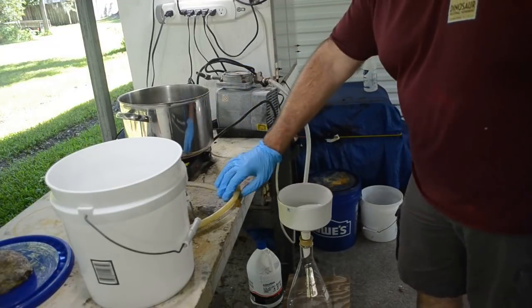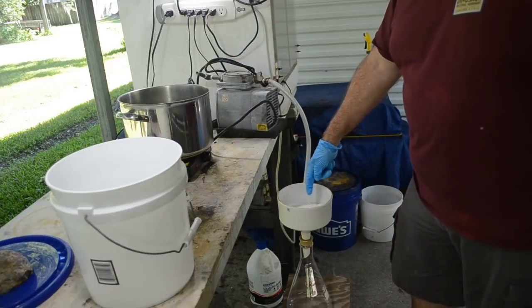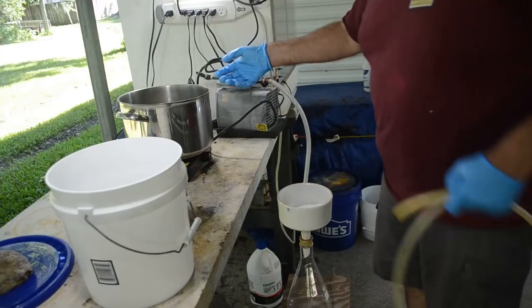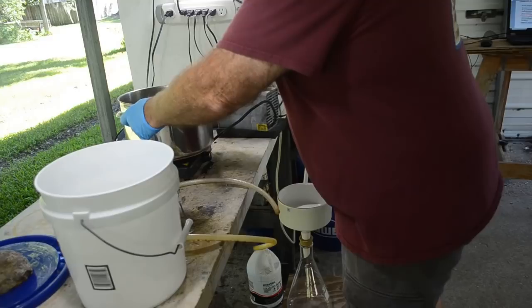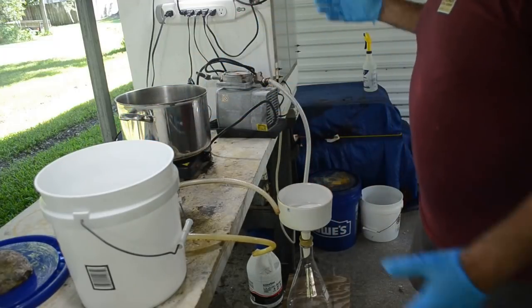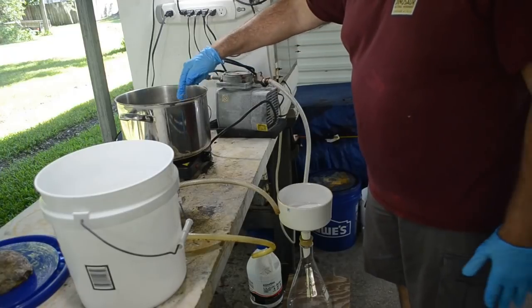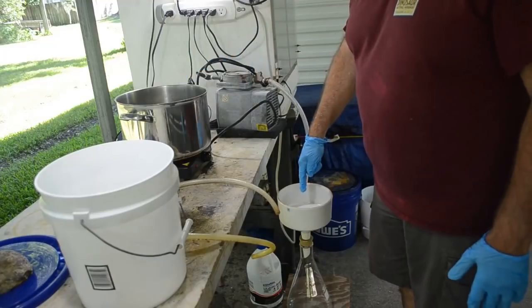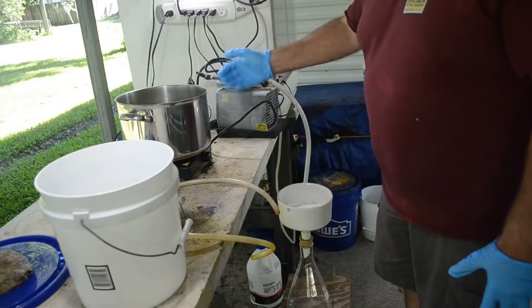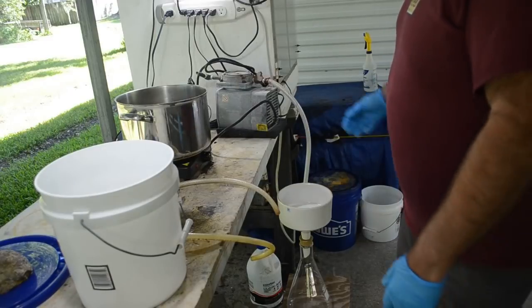So I'm going to siphon the liquid out of here into the Buchner funnel. I've got a filter in the Buchner funnel. Just because this is so heavy and awkward and not easy to pour, I don't want to splash or slosh or splatter that pregnant gold liquid all over the place. So I'm going to siphon the bulk of it out of here into the Buchner funnel. And then once I get the level down to something more manageable, I'll just pour the rest of it in. That'll probably be the last batch.